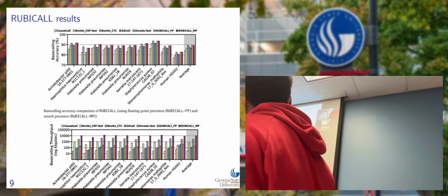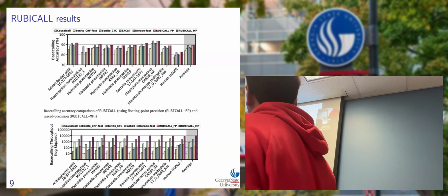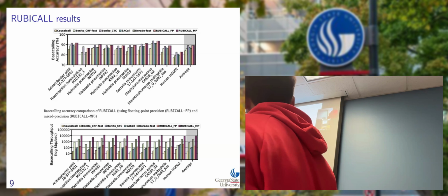Even if you change the data slightly, the performance differs. For floating point, there is a drastic jump between hundreds of thousands. The orange column, second column. Exactly. Right. So that should also be taken into consideration.